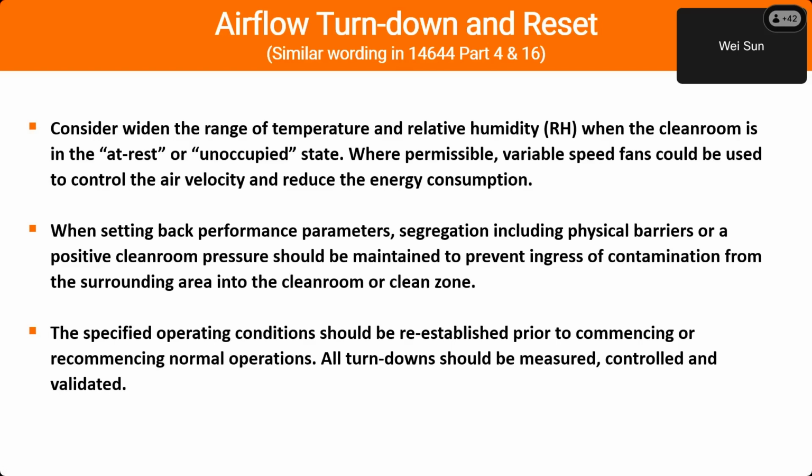But if you have particle counters or particle sensors to validate, 24/7, that your ISO cleanliness class can be maintained within the specification, then this will provide you a very strong proof that the air cleanliness is being maintained, even if you alter the airflow rates.